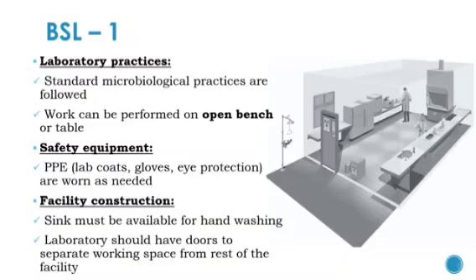Biosafety Level 1. The microbes here are not known to cause disease in healthy adults and present minimal potential hazard to laboratorians and the environment. An example of a microbe that is typically worked with at a biosafety level 1 is a non-pathogenic strain of E. coli. The laboratory practices. Standard microbiological practices are followed. The work can be performed on an open bench or table.